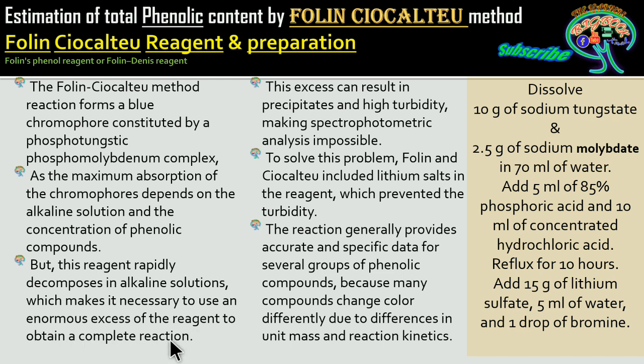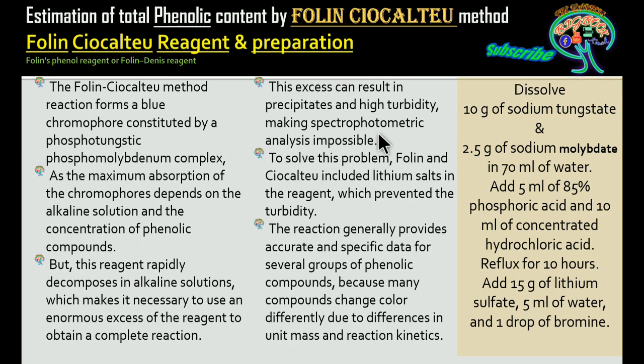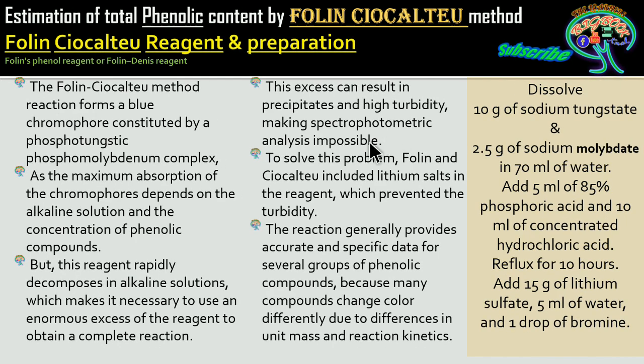Decomposition, in the sense, is going to give a kind of precipitate. Because of that, the chromophores or the products formed are going to precipitate, so this excess can result in precipitate and high turbidity, making spectrophotometric analysis impossible. High turbidity is also because of the formation of the precipitate, which is not going to settle down. The remaining solution can be clear, but because of the turbidity, analysis is impossible.